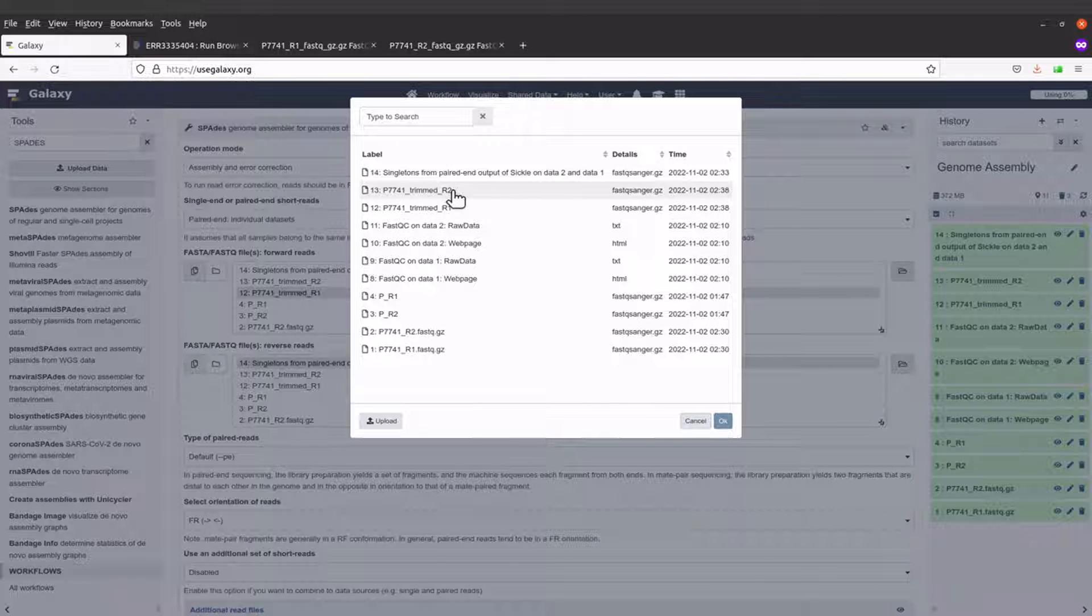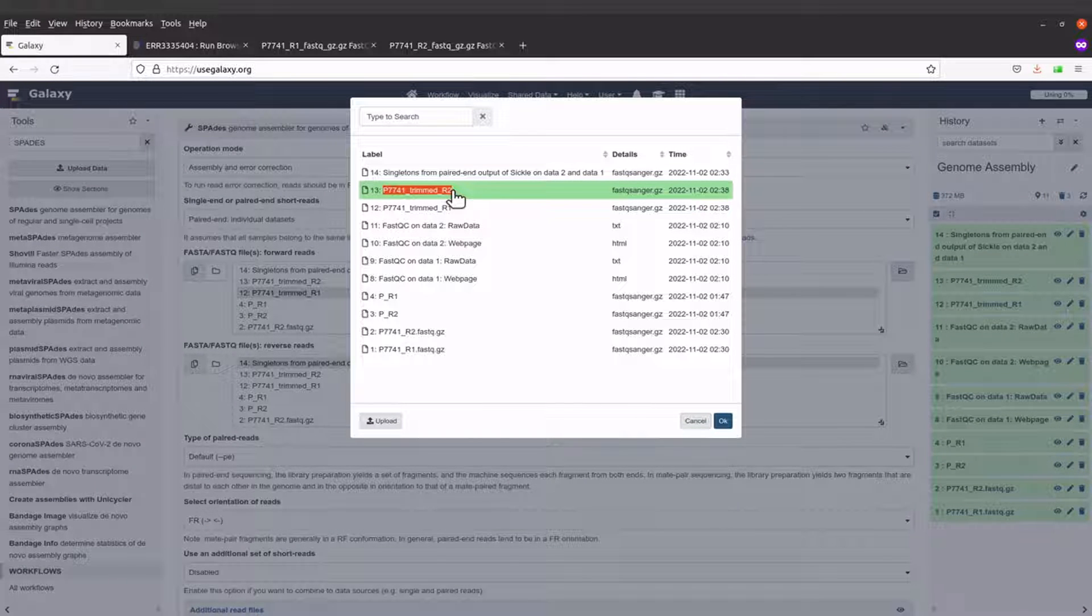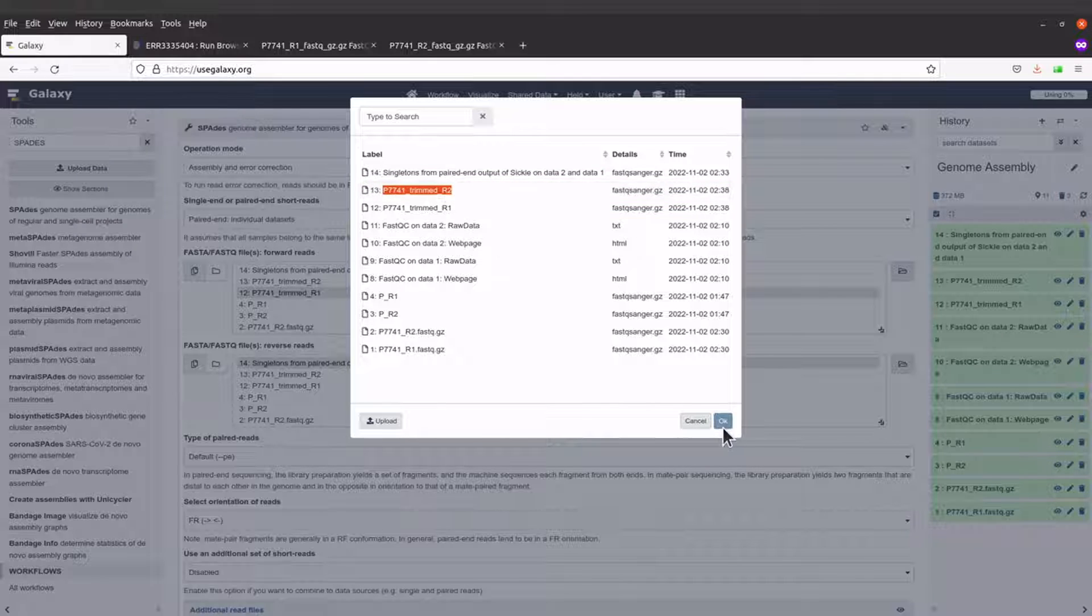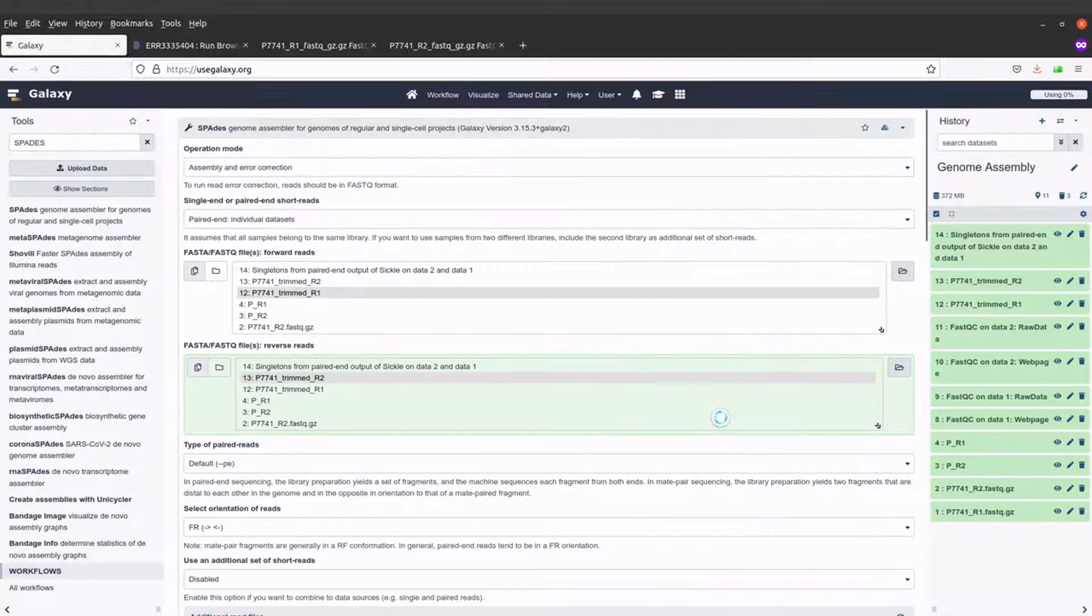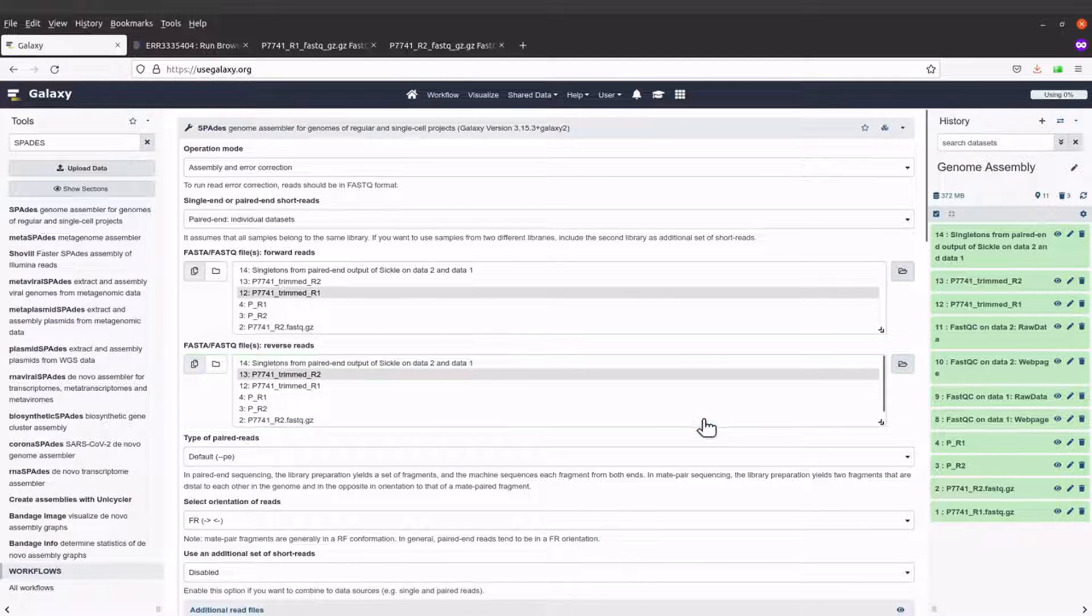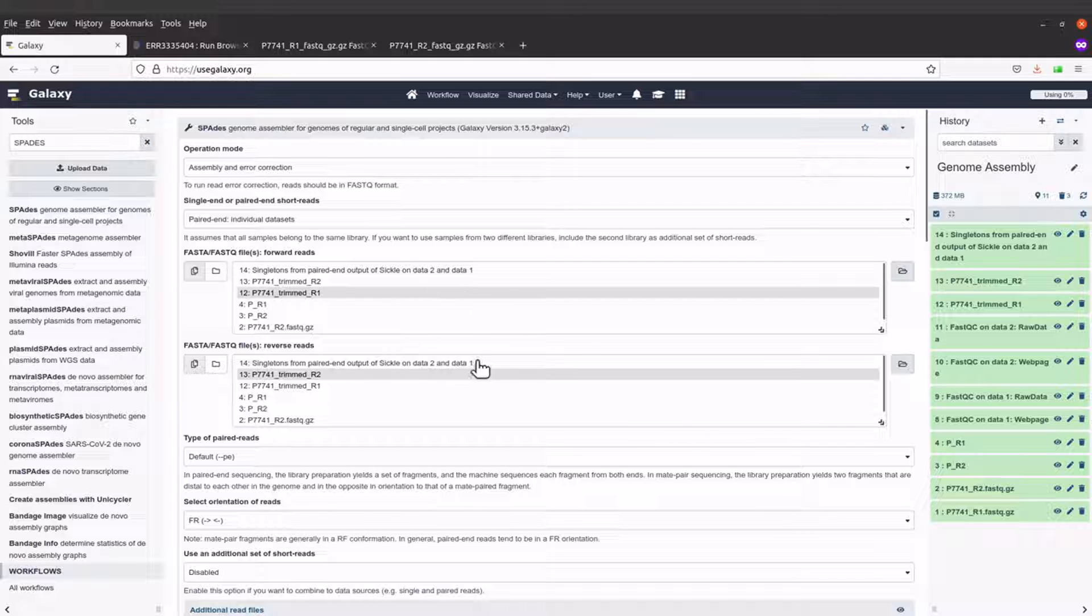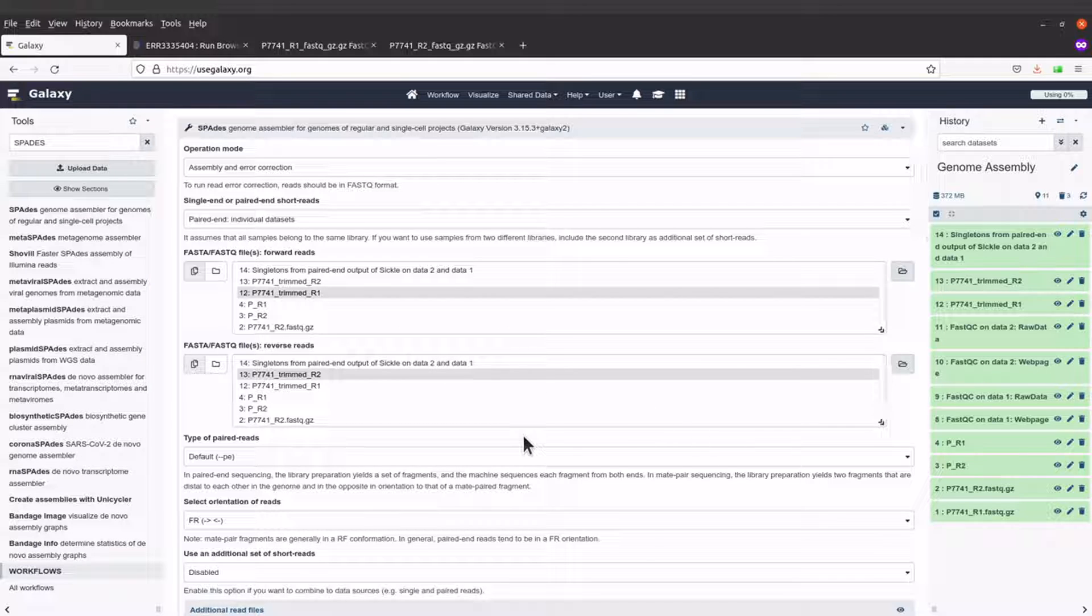When I come to the reverse, I'll select the R2. So these are the files that I'm going to use.